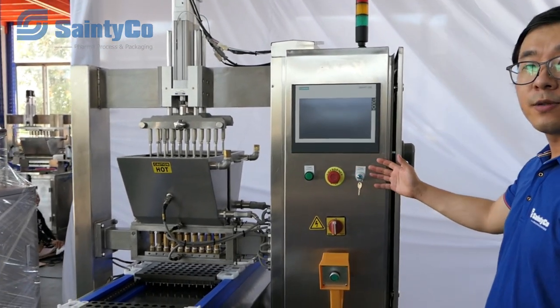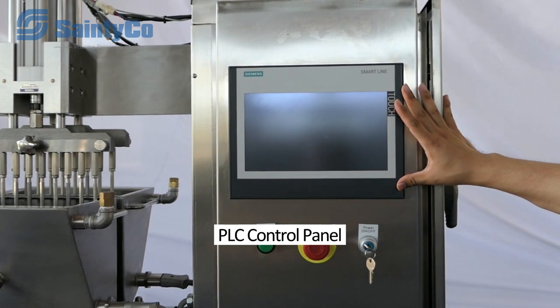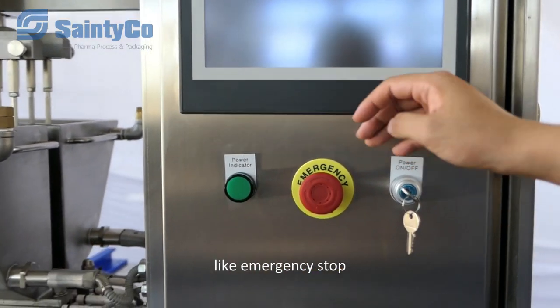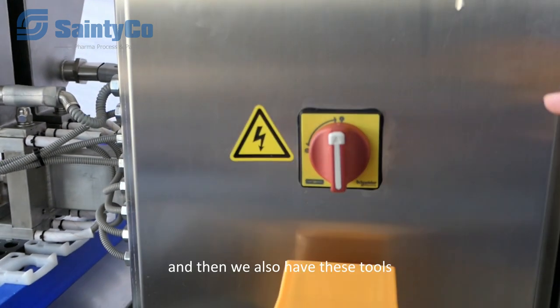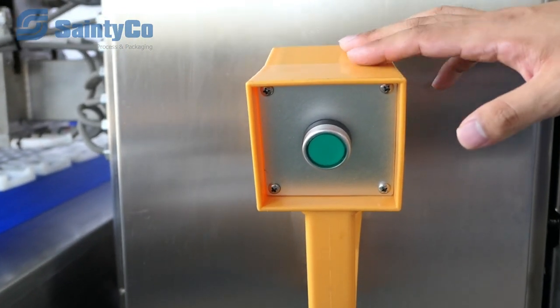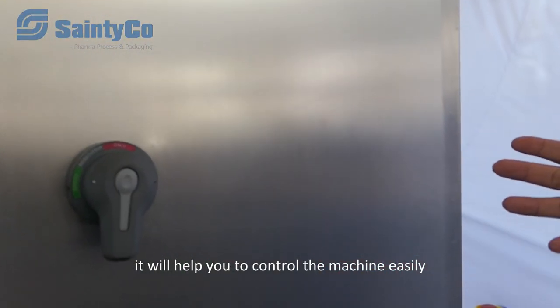Let's take a look at the components of the machine. Here you can see the control panel with the touch screen, where all the parameters will be set to control the machine. We also have physical buttons like the emergency stop and the main power. There is also a manual mode button to help you commission the machine, and another switch for the main power to help you control the machine easily.